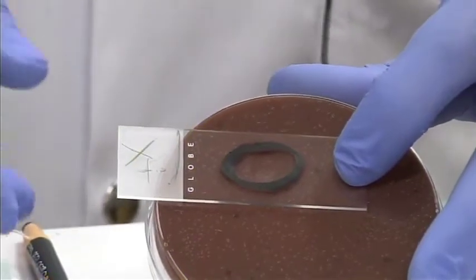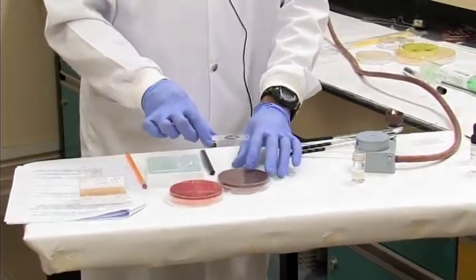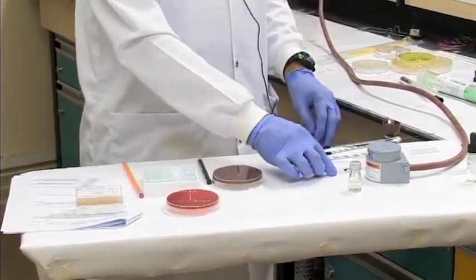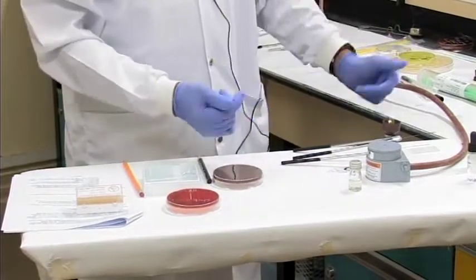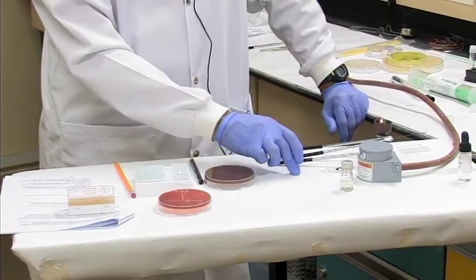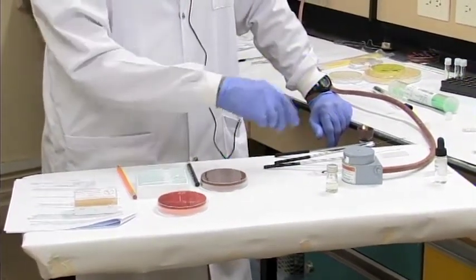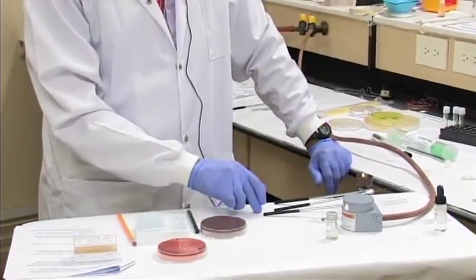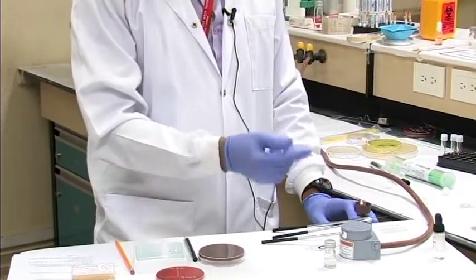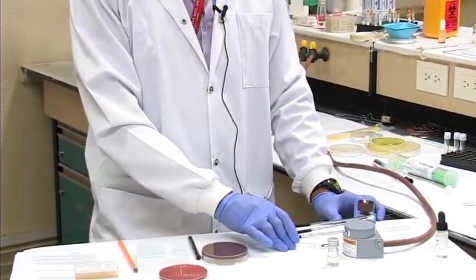So there's a light suspension you need to create, and once that is made, you can simply place it next to your flame on the bench, and the warm draft will dry that slide. It's important to air dry the slide before moving on to the staining process. Once the slide is air dried, you need to heat fix it by passing it through the flame, which I'll demonstrate in a short while. So while the slide is drying, in preparation for the Gram stain, I will now move on to the culture to show you how we culture agar plates, how we streak, etc.